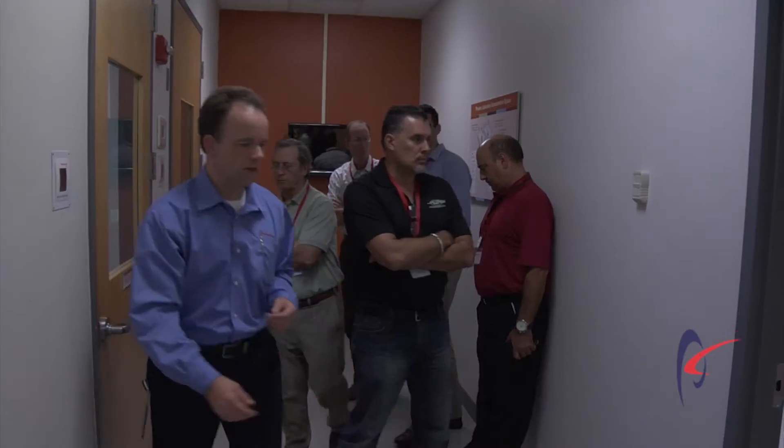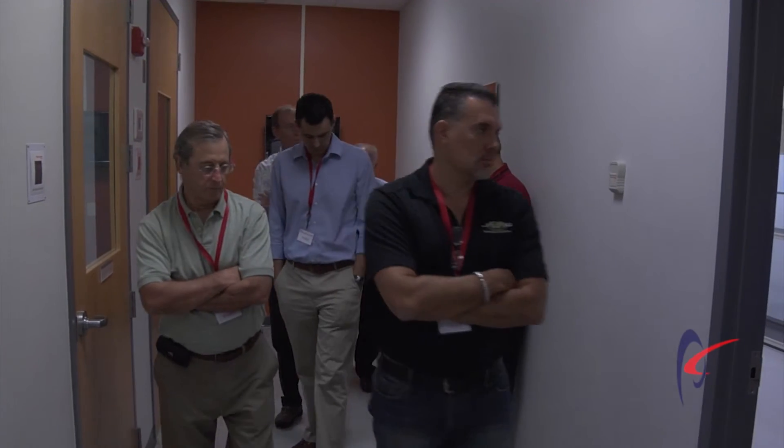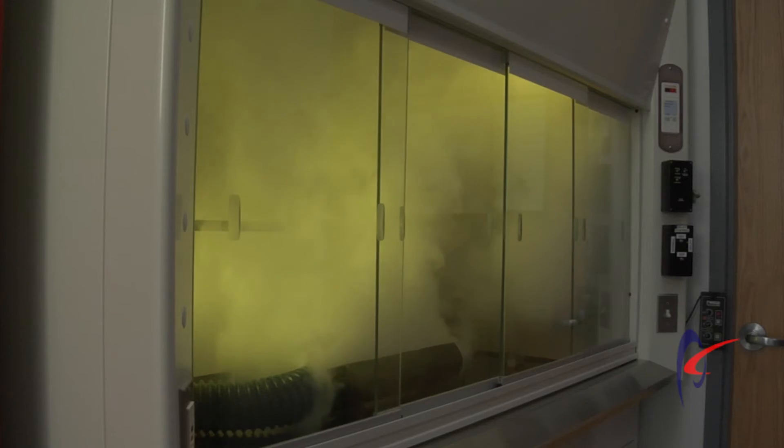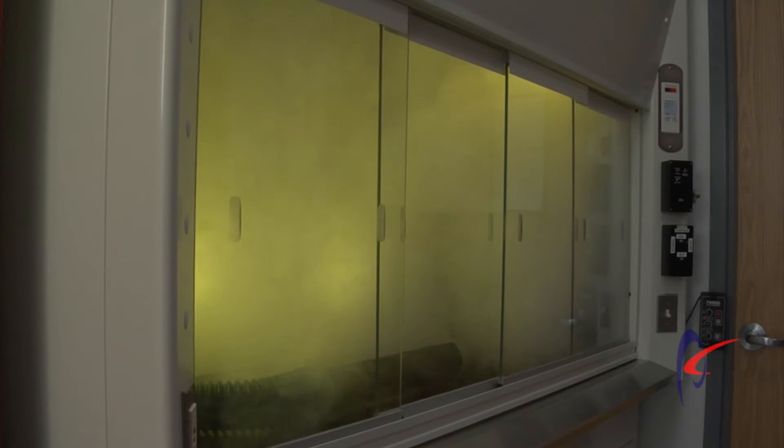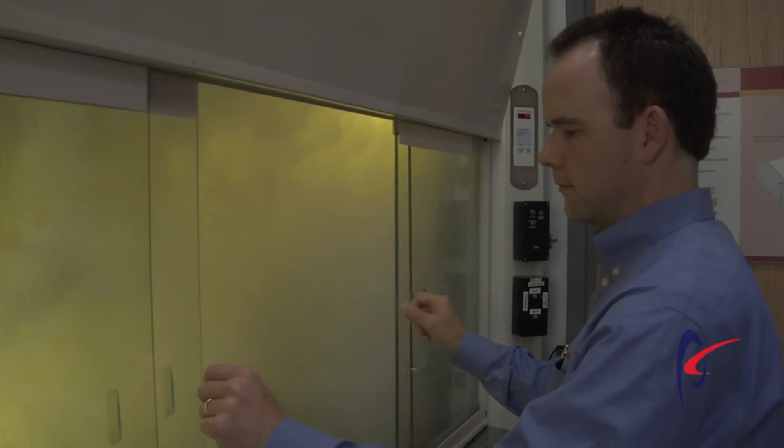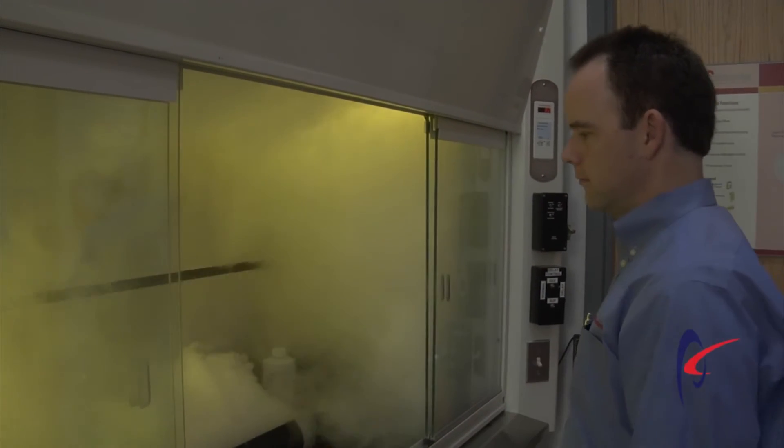The fume hood containment demonstration that we do here at Phoenix Controls at all of our customer visits is very dynamic. We have a smoke machine inside a fume hood so you can visualize the airflow patterns. And we operate that in a Phoenix mode, which is that less than one second speed of response. Move the sash into various different positions, openings, closings, and we see that visually from that smoke, proper containment at all times and all positions.